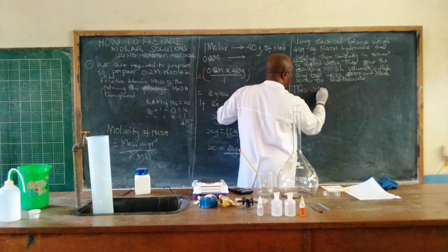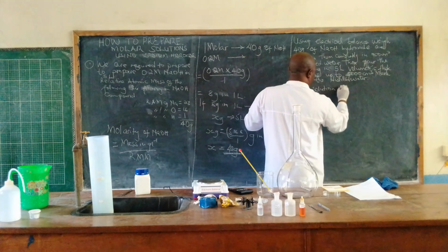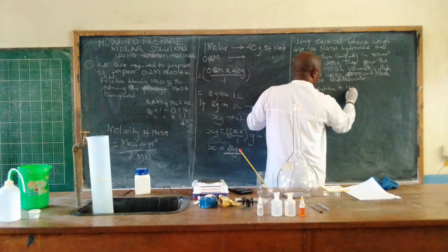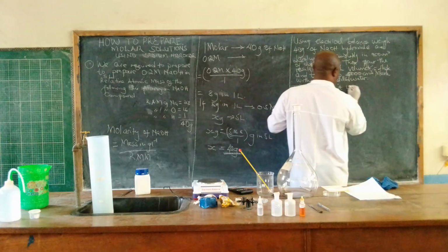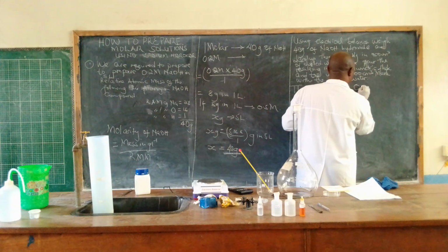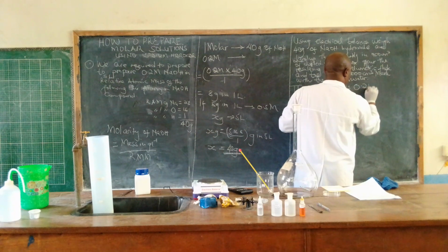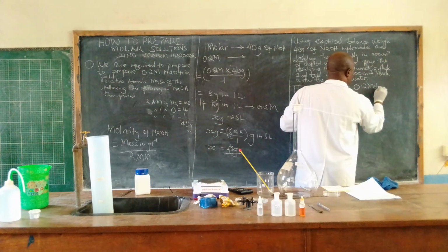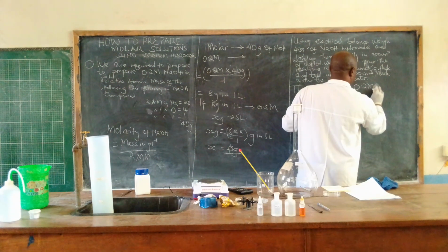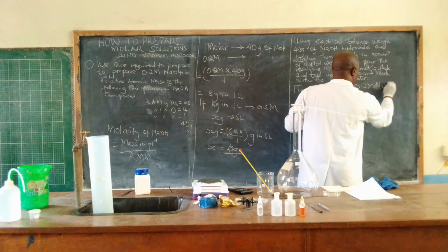This solution is said to be 0.2 molar sodium hydroxide.